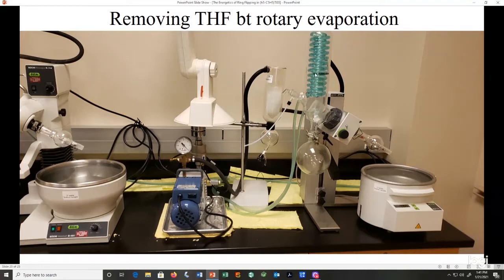And over here we have two cold fingers. This one right here is supplied with a circulation bath, which supplies a cold fluid in here. And then there's a secondary trap right here filled with dry ice and isopropyl alcohol. This secondary trap is to make sure that no solvent gets sucked into our pump right here. And then finally we have our vacuum pump here, and this is where we can control the internal pressure of the system. This is basically a closed system.